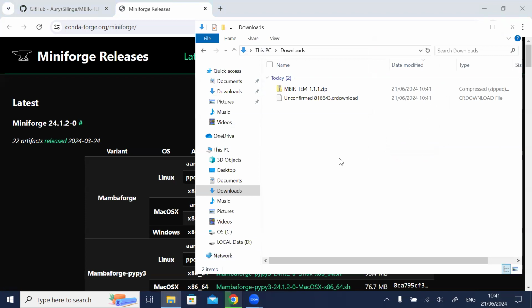Now, the reason why you would want to use the software is if you find yourself in a situation where you're trying to characterize a ferromagnetic sample, and you measured the phase from different directions so you could get a 3D reconstruction of the magnetic induction. But if you want to also get the magnetization, this tutorial will show you how to do it.